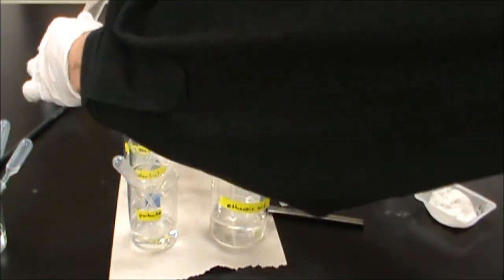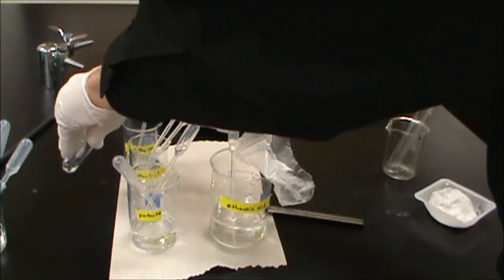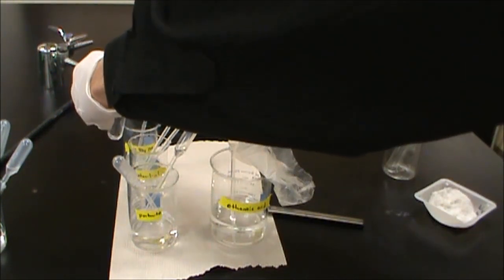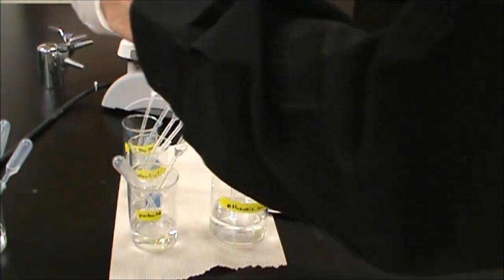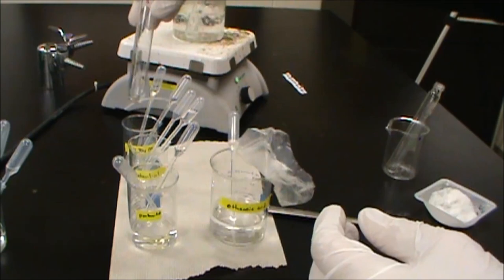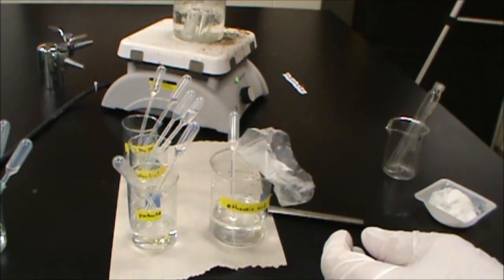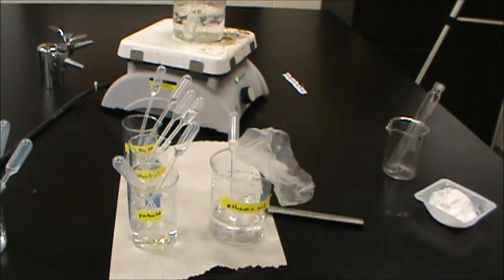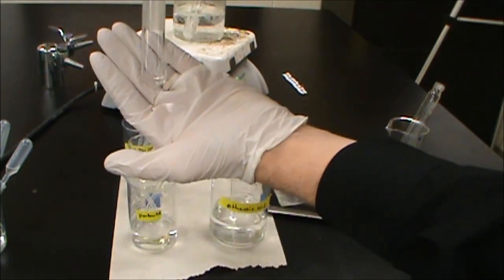And we're going to go ahead and add two drops of sulfuric acid for the catalyst. And make sure we get that off the sides. And there we go. That's ready to go in our hot water bath for about five minutes. So you'll note that this one is clear and colorless to start.